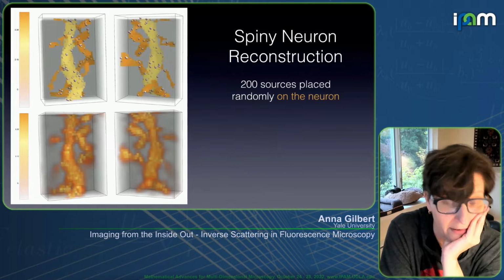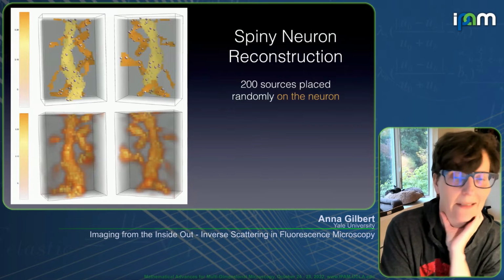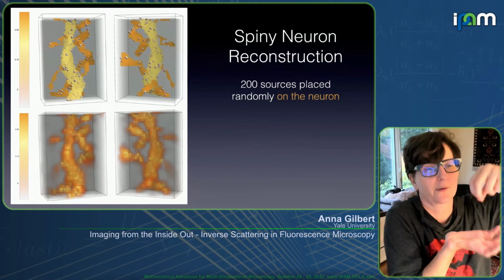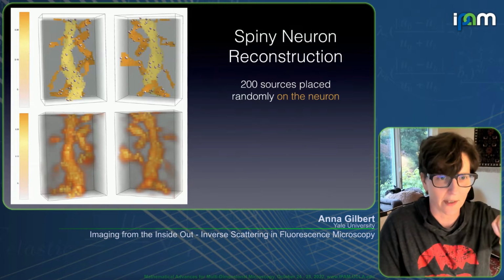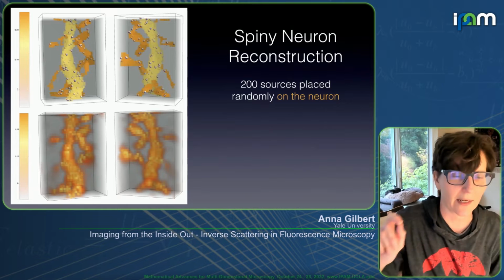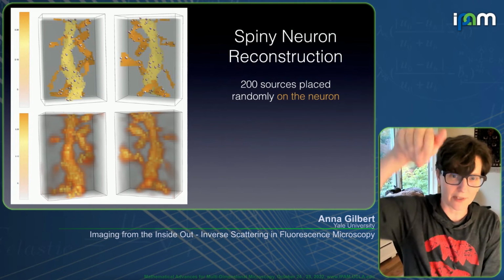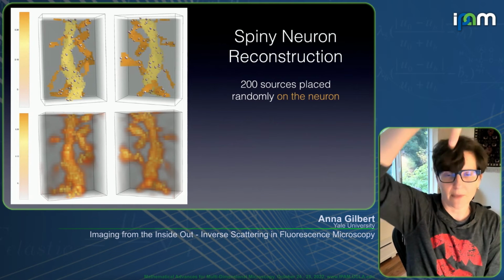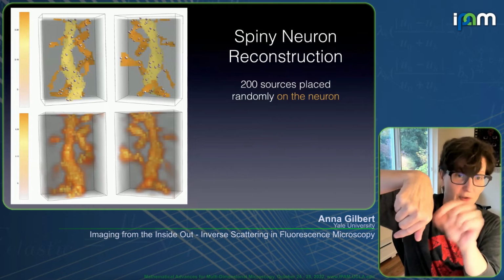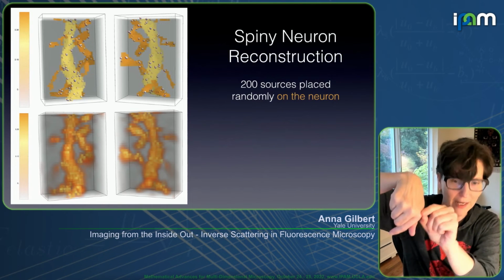It's a little blurry, but it's not bad actually, and you're resolving more than simply the structure on which the fluorophore sits. So excuse me, my mouse, I don't know, in this play mode, I can't see the mouse, but in the image on the upper right, you can see there's a tendril sticking out, and there's one fluorophore just right at, almost where the tendril attaches to the body.